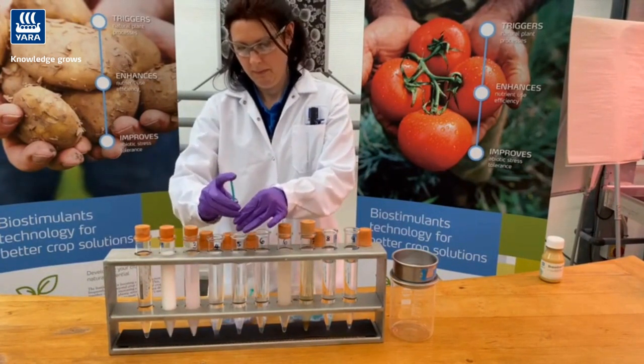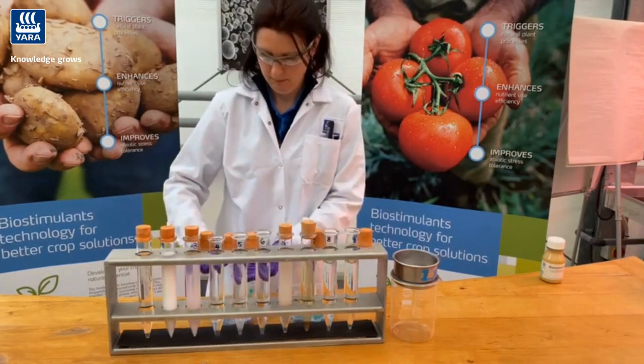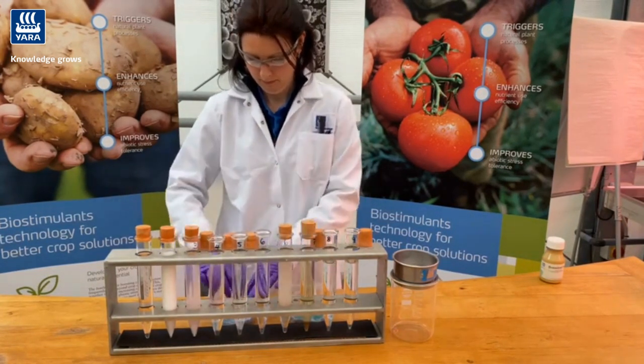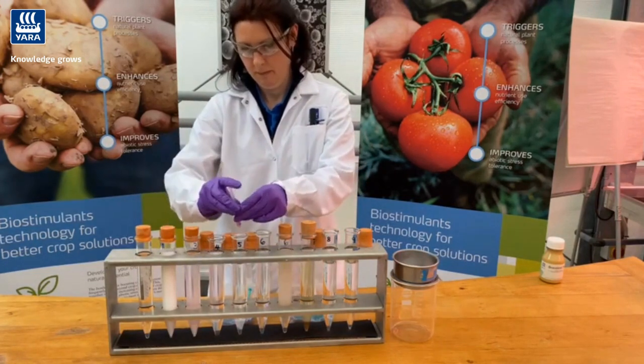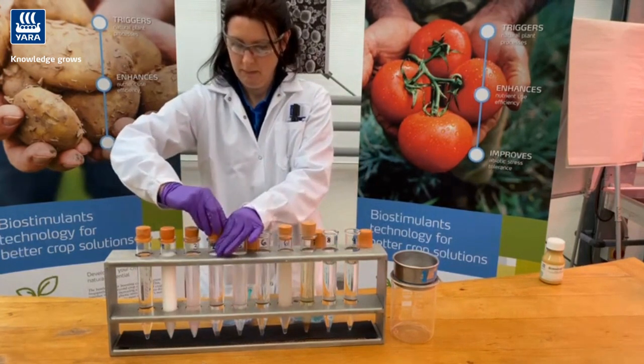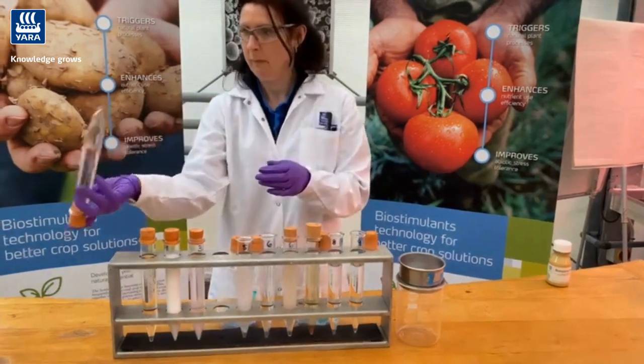These next two show the importance of rates. So both of these tubes have the same product. One product is applied at 1 litre a hectare in both tubes. The other product is applied at 5 litres a hectare in one tube, 2 litres a hectare in the other. Which is which, do we think?